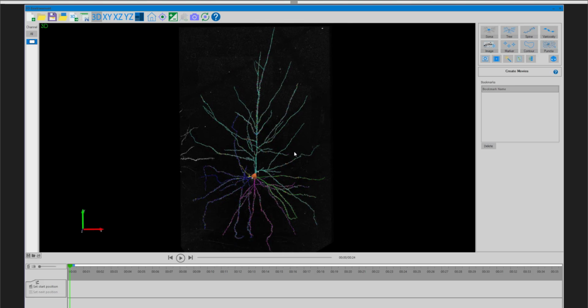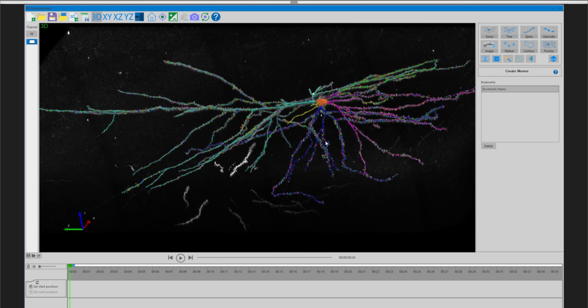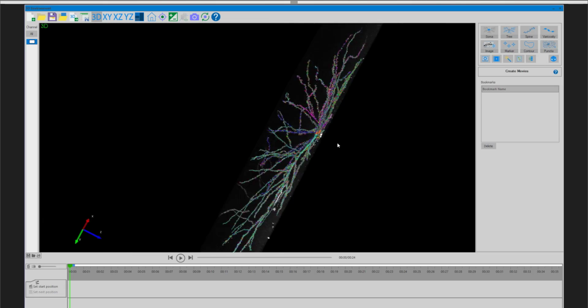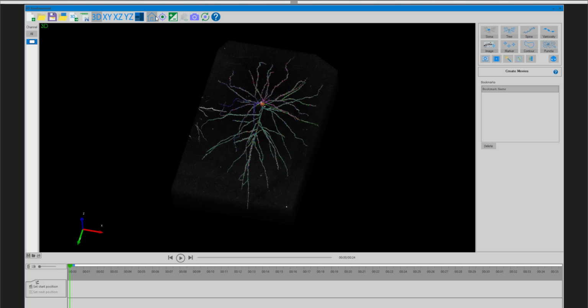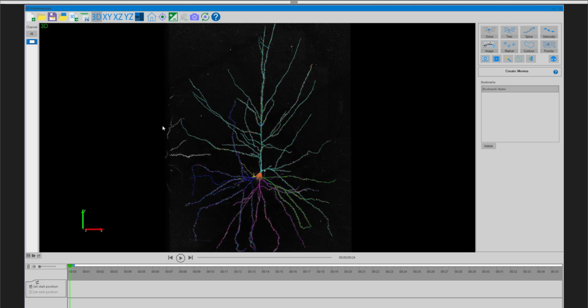This is different from a lot of the other movie making programs that exist out there, so it's a nice time to walk through how this is being done. Right now, as I rotate and zoom, we are in the movie mode, but none of these movements are being tracked. Nothing here is being recorded, and that's important to know. Right now, we're getting ready to set our start position. As I start to do this, I can explain how the movie mode works.